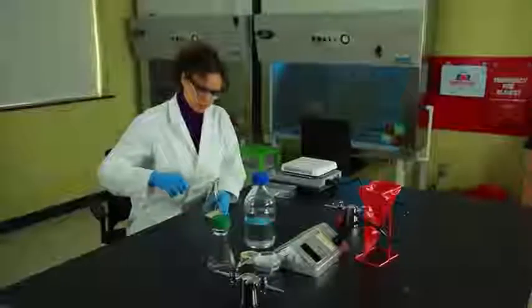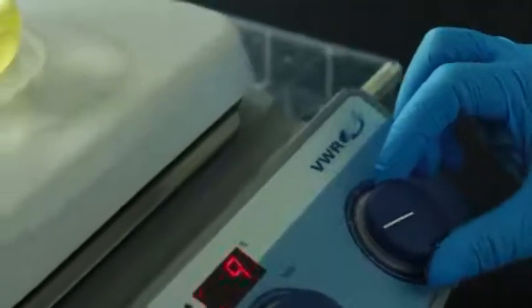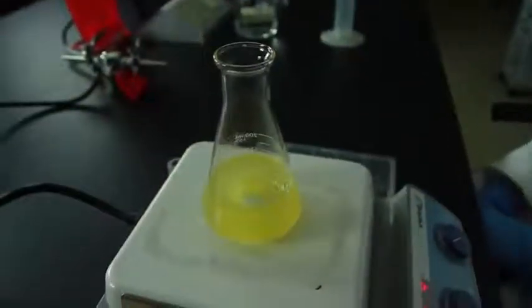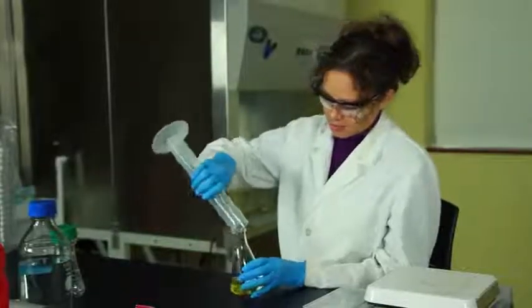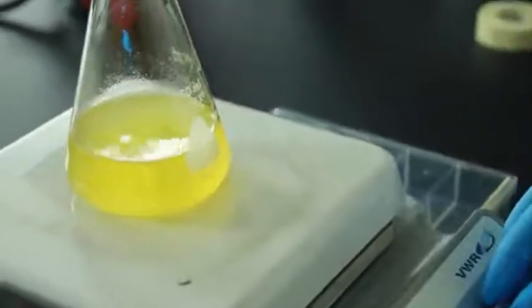Add about 75 milliliters of deionized water. Place the flask onto a stir plate. If you're using a combination hot plate and stir plate, be sure that the heat is turned off. After about 2 minutes, add the remaining 25 milliliters of water from the graduated cylinder. Stir the solution until all of the visible clumps have been broken down.